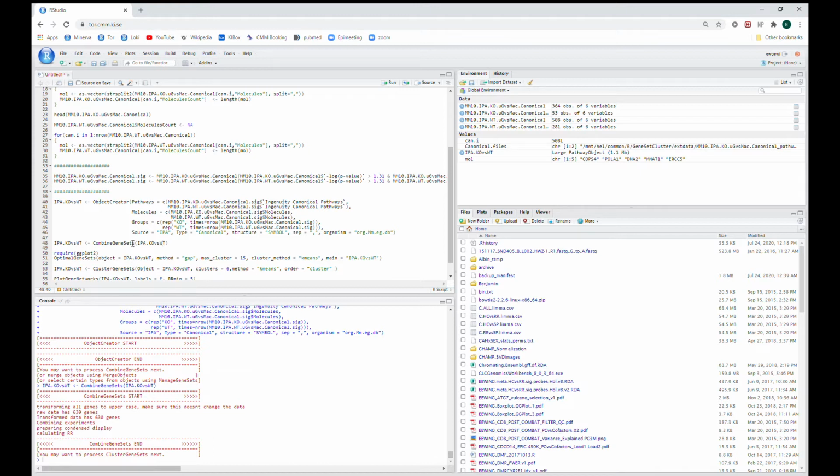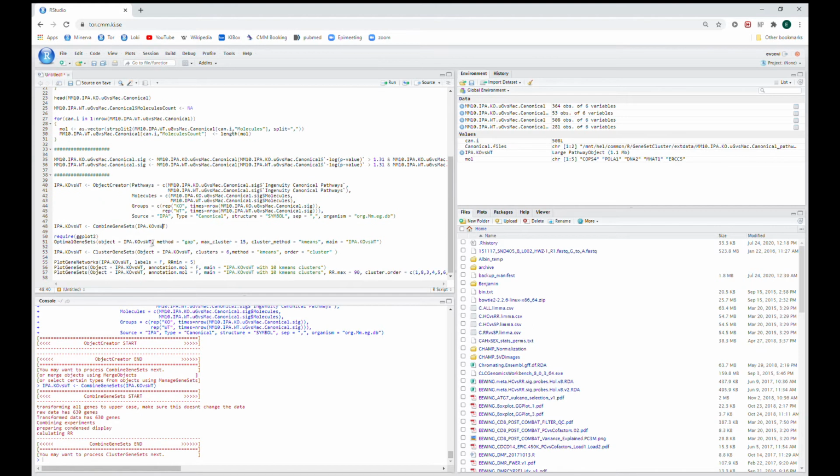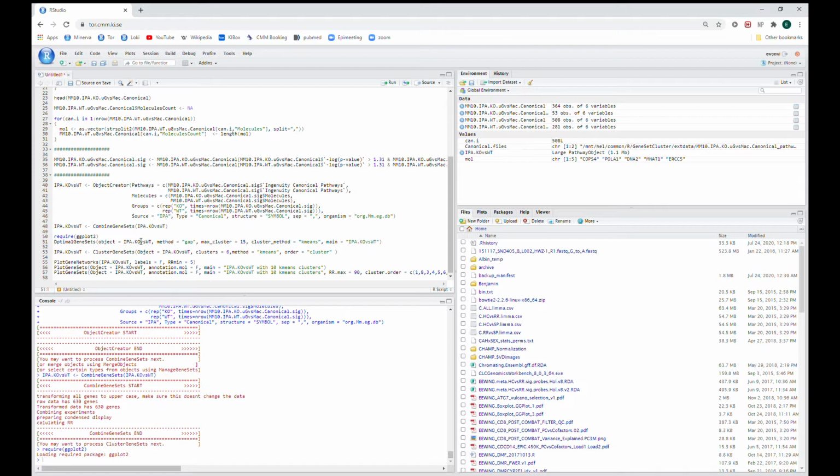And depending on the number of genes you have enriched, one might be better than the other. RR works quite a little better for smaller gene sets. Jaccard works very well for larger gene sets. Cohen's kappa is somewhere in the middle, but it depends on what experiment you have. And then we want to determine, well, what's the number of optimal gene sets that we have.